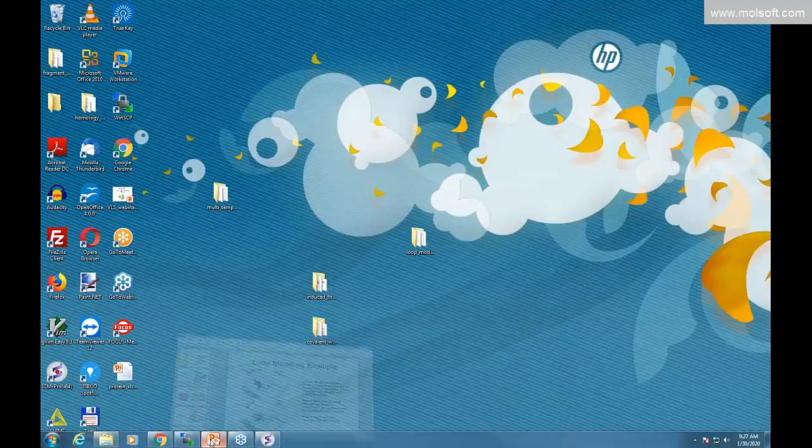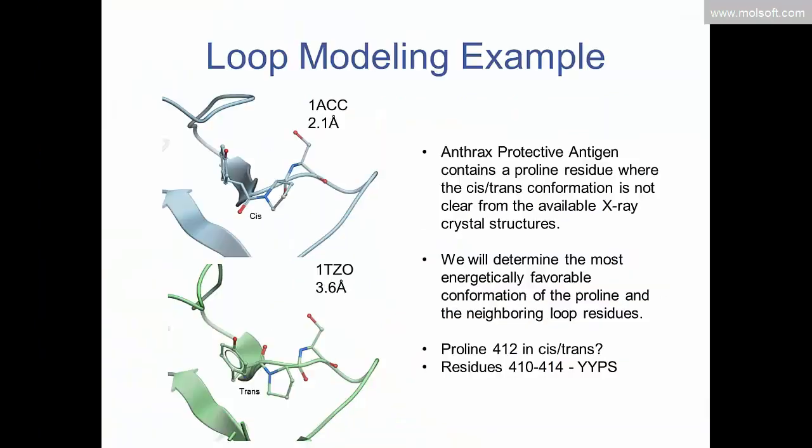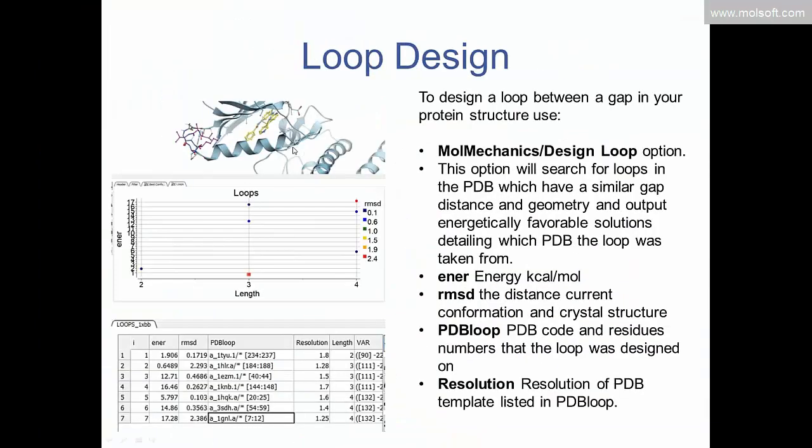Go back to the slides. So you may also be interested in loop design. So you may have a gap in your loop, or you may have a region where you want to do some protein engineering and find the preferred loop region there.